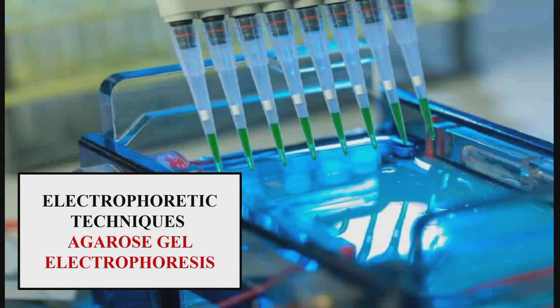So today in this lecture we are going to study one technique, that is agarose gel electrophoresis. Agarose gel electrophoresis is an electrophoretic technique that is used in different laboratories for experimental purposes.